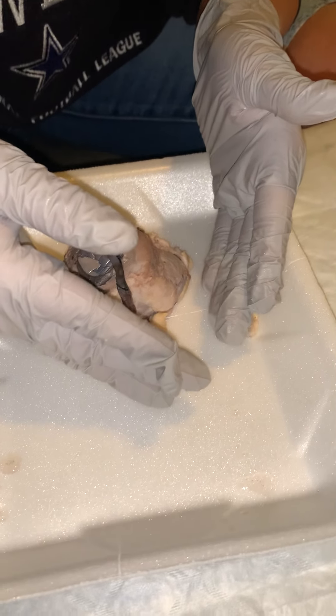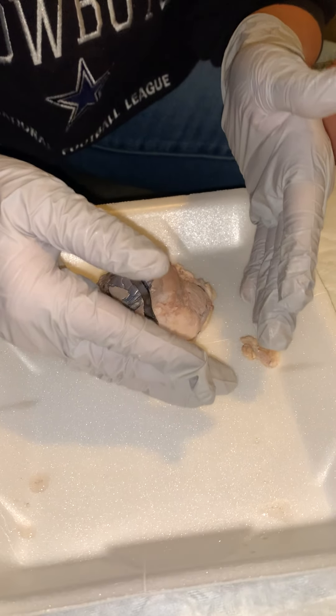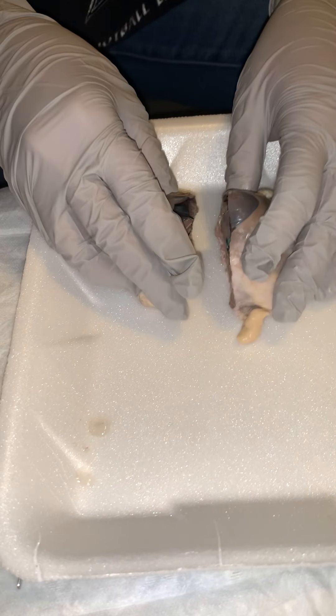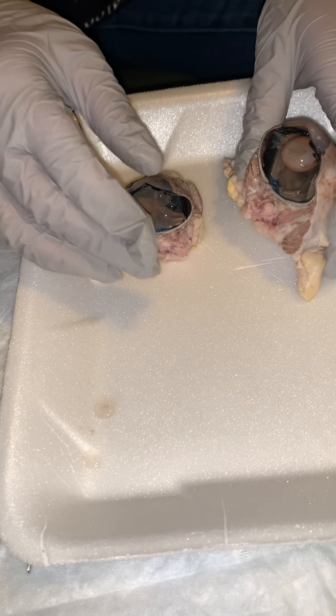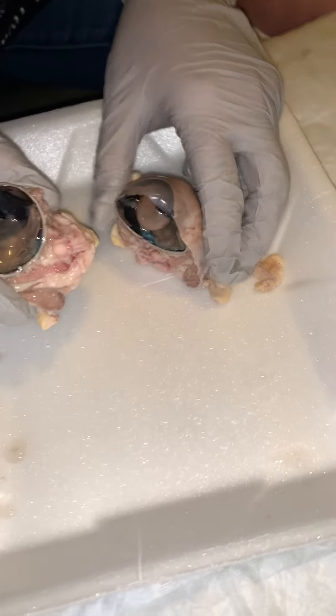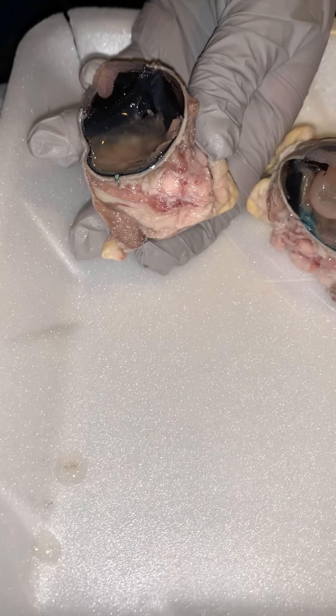We have two chambers: anterior and posterior. The anterior is going to house the aqueous humor, and the posterior houses the vitreous humor — right there, a jelly-like substance.